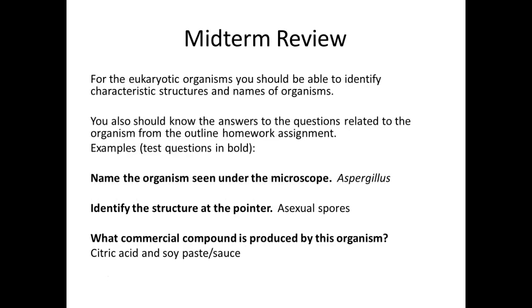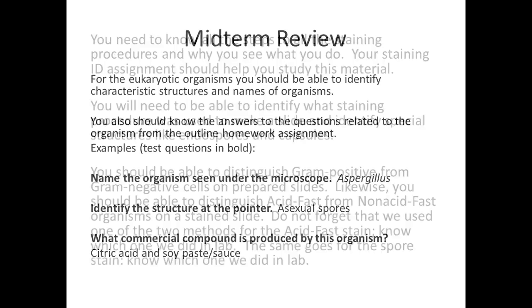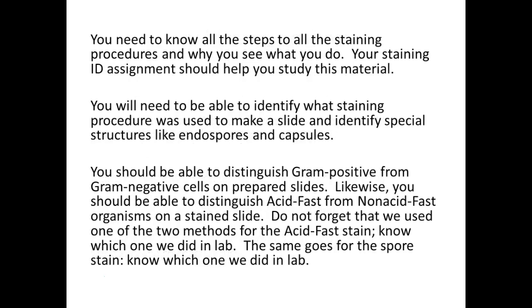So again, like that quiz I had set up for you in the bonus one that you should still be able to see your results for, this would be how it would probably be set up at a station, where I would have these questions. I'd have the Aspergillus slide there. You'd have to identify it's Aspergillus, that the pointer is pointing to the asexual spores. And I could ask the question about what commercial product is produced by this organism. So make sure you review all the stuff about those guys. You'll need to know all the steps to all the staining procedures and why you see what you do.